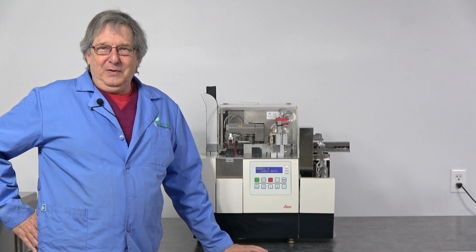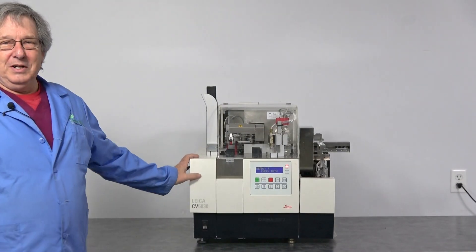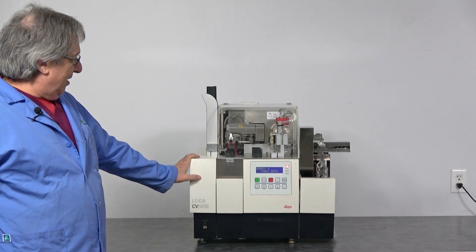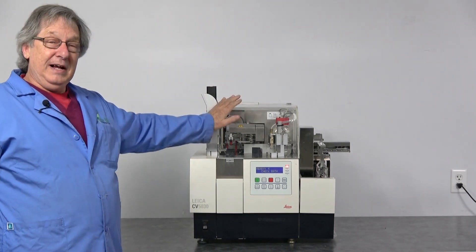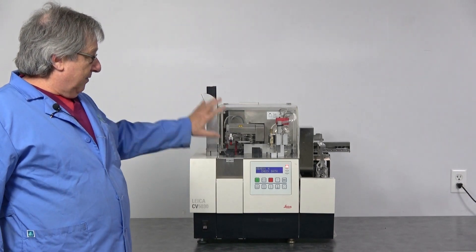Hello, welcome to Cridersville, New Life Scientific Lab. One of the videos I wanted to show you is the Leica CV5030 cover slipper.